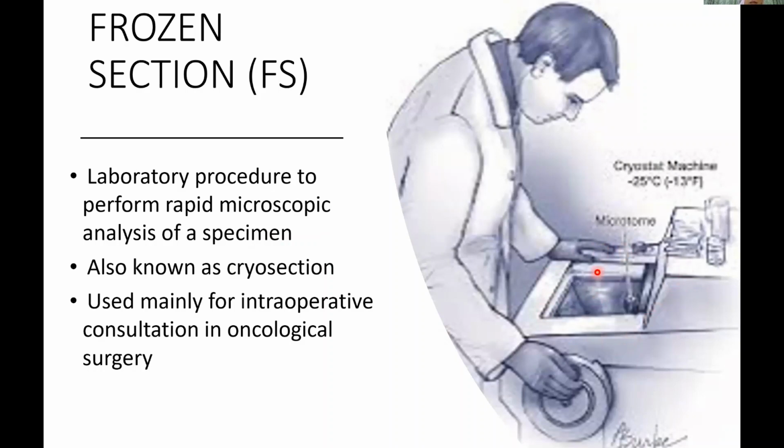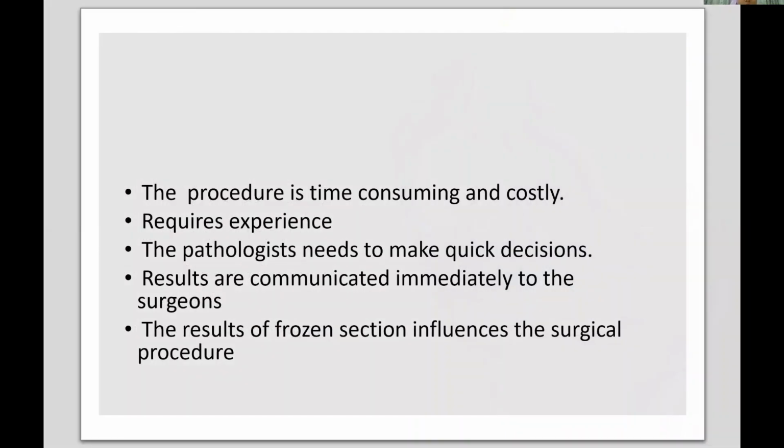So this is how we do the procedure. We need to freeze and cut the specimen inside this machine. It is used mainly for intraoperative consultation in oncology surgery. Okay, it's a little bit about frozen sections. Actually, the frozen section procedure is time consuming and quite costly.